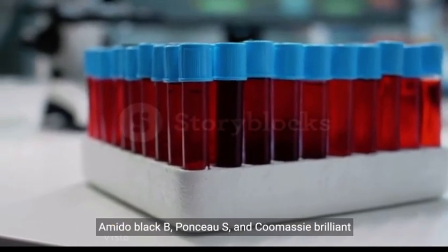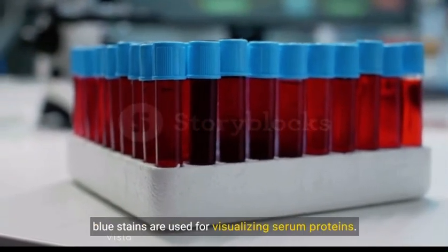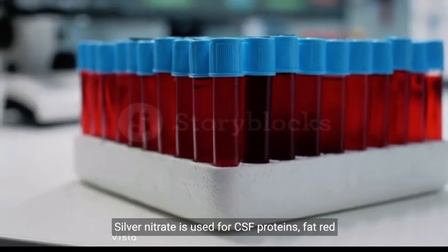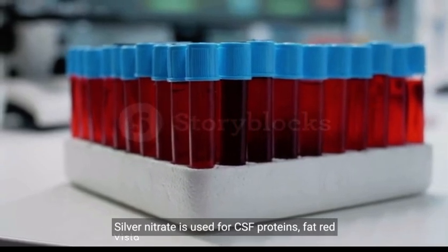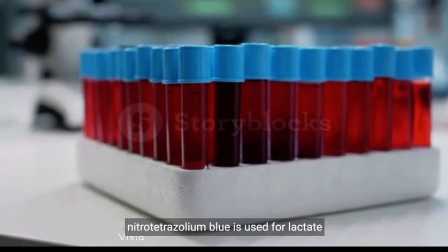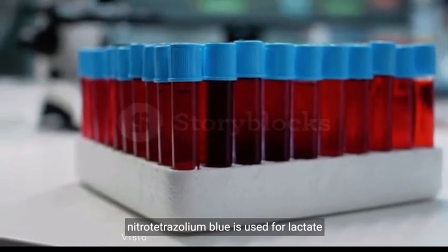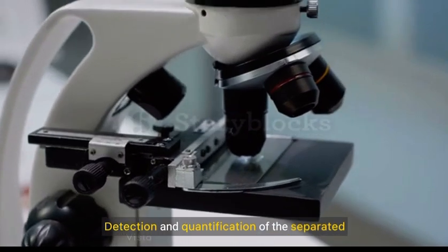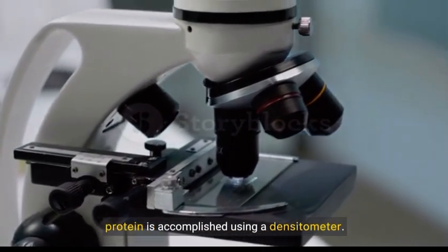Amido Black B, Ponceau S, and Coomassie Brilliant Blue stains are used for visualizing serum proteins. Silver nitrate is used for CSF proteins. Fat Red 7B and Oil Red O are used for lipoproteins, and nitroblue tetrazolium is used for lactate dehydrogenase isoenzymes. Detection and quantification of the separated protein is accomplished using a densitometer.